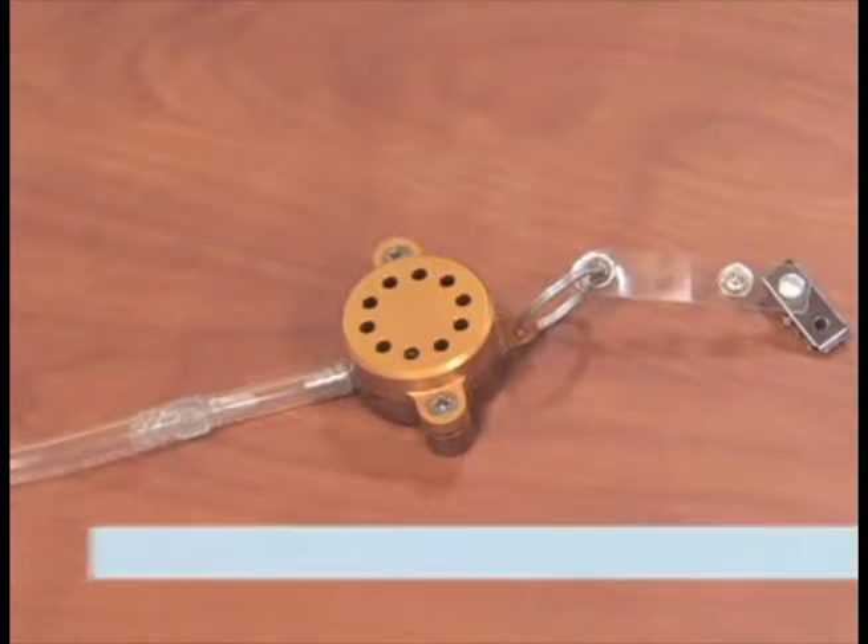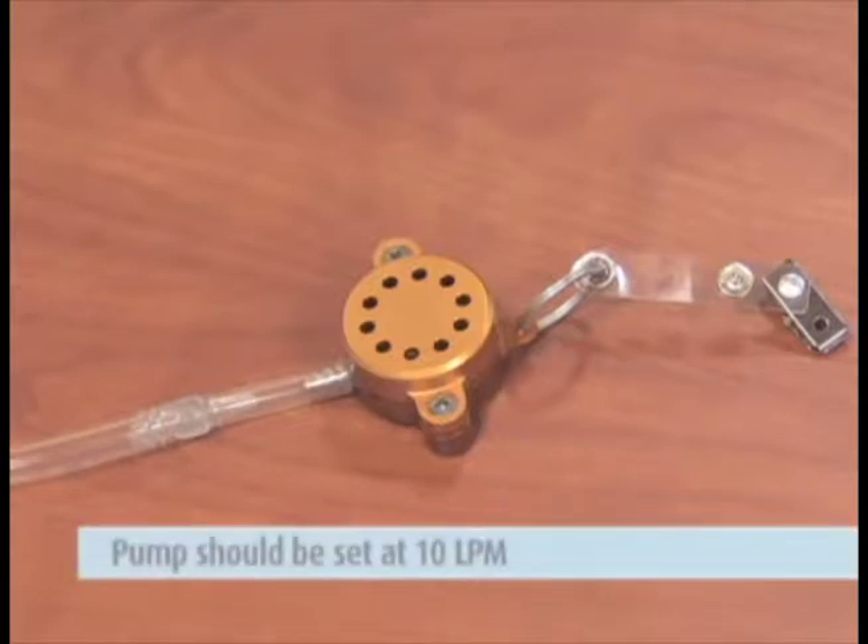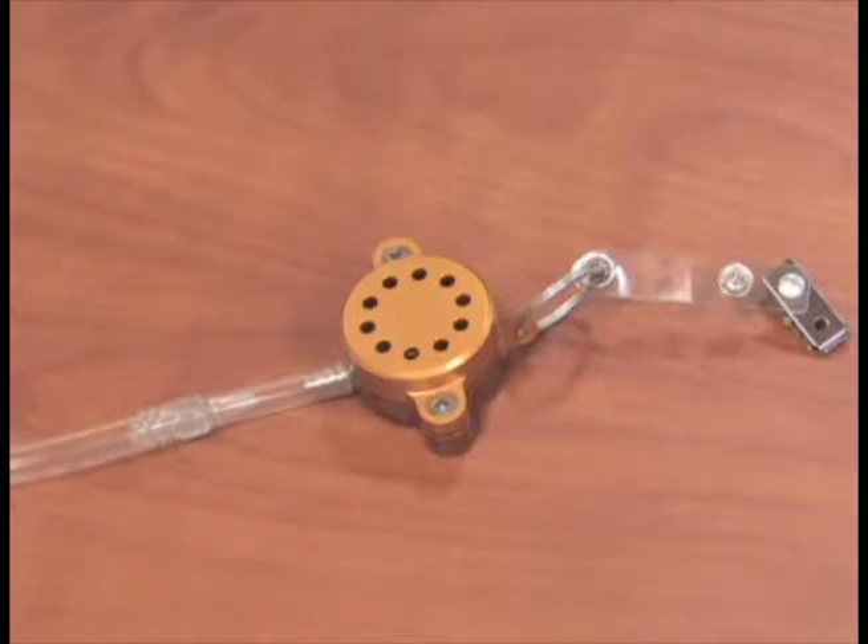If performing PM10 sampling, place the sample in the area you are collecting with the inlet side up. Your pump should be set at 10 liters per minute and you should be using a gold-colored PEM marked 10 LPM.